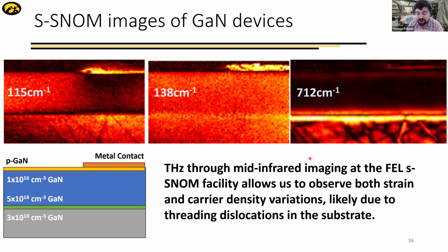People noted that there was something weird going on in the region close to the boron nitride phonons, but in the first paper they didn't really expand on it. Subsequently, people expanded on it. There's a nice paper where people have even seen interfacial relaxation effects in SNOM, and the effect that has on polaritonics as well. So you can actually get sensitivity to these effects.